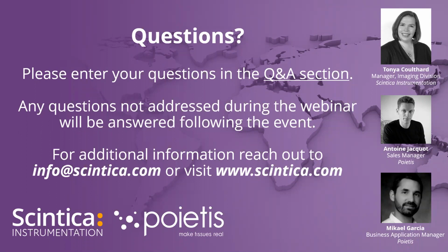So actually not. The cells that we presented before are cells that we print for one of my European projects on pancreas. So we are actually working with different kinds of pluripotent stem cells, but there are no publications on that yet. But I hope in the next few years, yes.